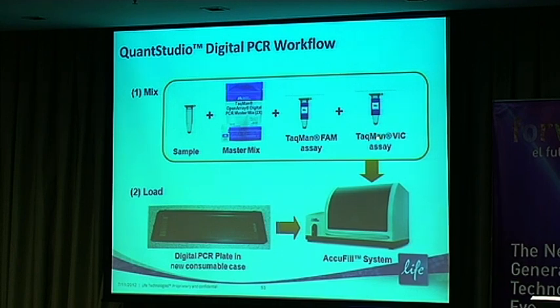The reason you would run a reference assay with the Vic fluorophore is so you can be certain that the copy counts you got are referenced back to a control input. So, let's say, if you knew that RNase P was present in your sample at a certain number of copies, or if GAPDH, for example, was non-changing, a static expressor, you can use that as a control.